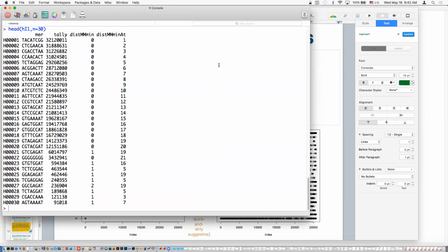So you can see there that basically, if you remember, it was like solid green, then skip 1 and then 1 more green. That was like the order of the canons versus the histogram. So that's the first 20, which are actually the expected guys. There's the 14 million number 19 expected sequence. There's the 6 million number 19 1 mismatch away sequence. Here is the phi x canonical sequence, number 21.